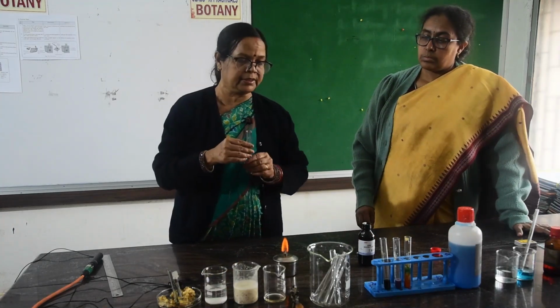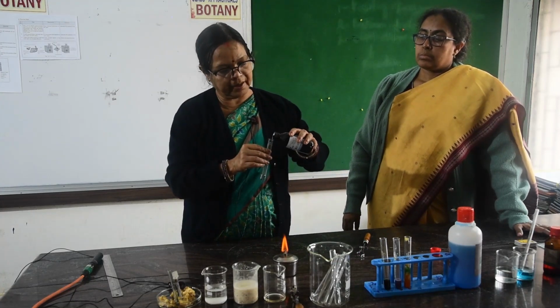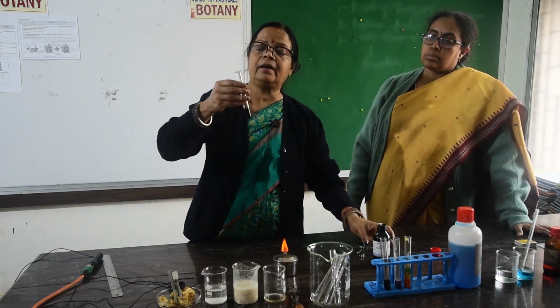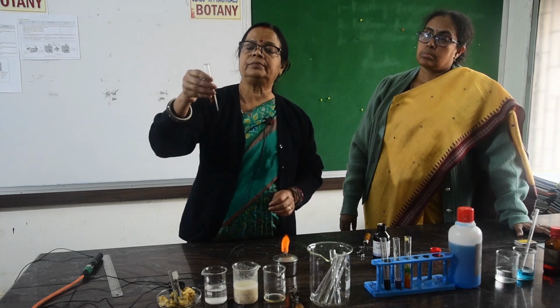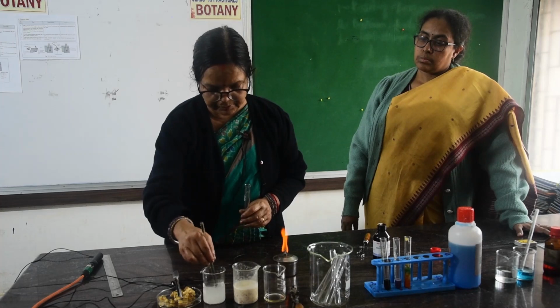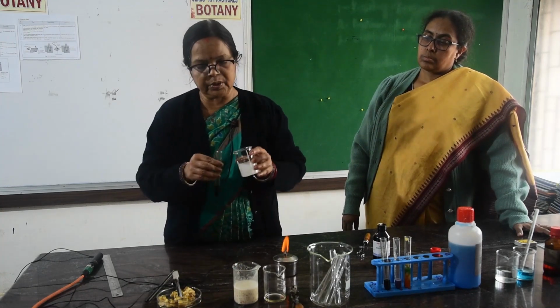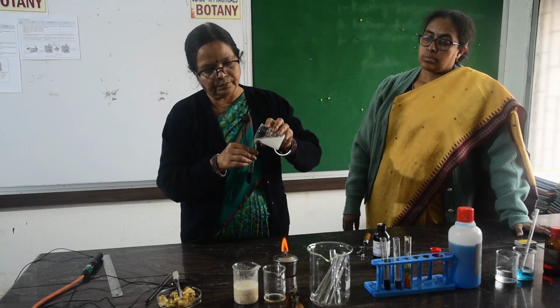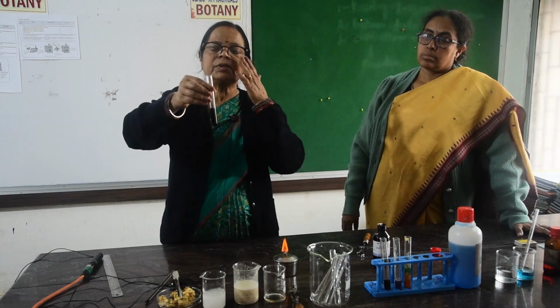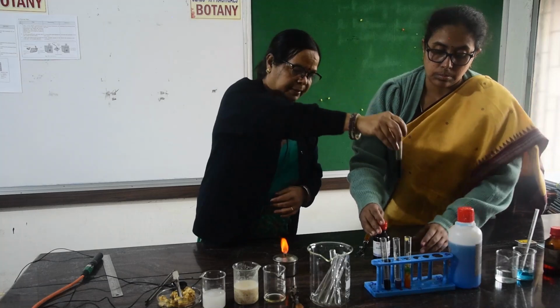Potato is also rich in starch, and rice and wheat are all rich in starch. When you add iodine and stir it, it turns blue-black color. This blue-black color indicates starch, which always reacts with iodine to give blue-black color.